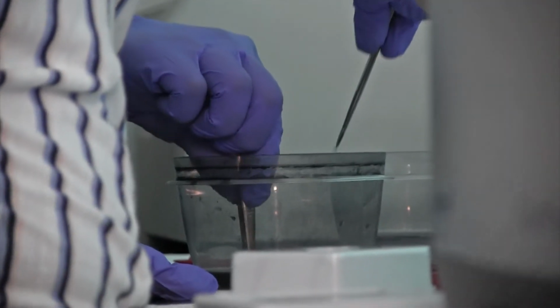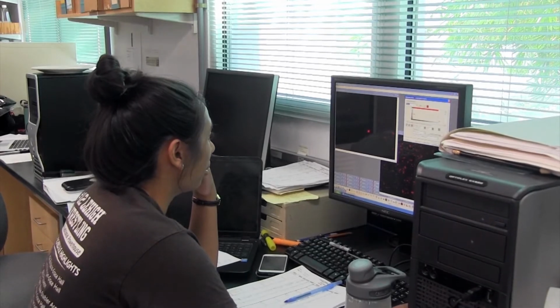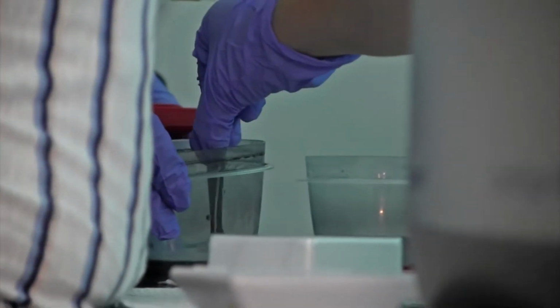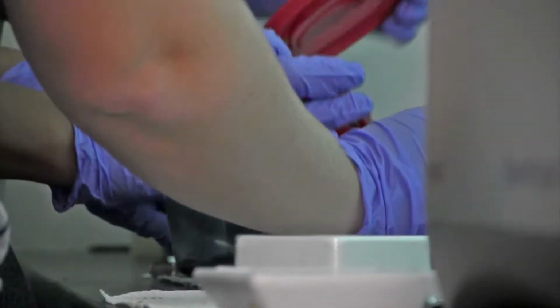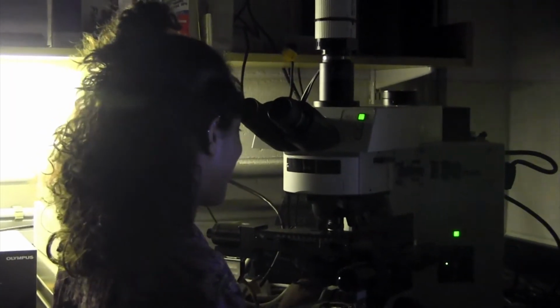The other thing that we need to do is stain the filters. The reason we have to stain the filters is because looking at a bright thing on a white background, you don't have as much contrast. So we stain it with a stain called Irgalan Black, which is a carpet stain, and it just stains the filters so that they're a nice grey colour, and it gives better contrast when we're looking at them on the microscope. So usually those are the first two things that you do. You thaw your samples and then you stain your filters.